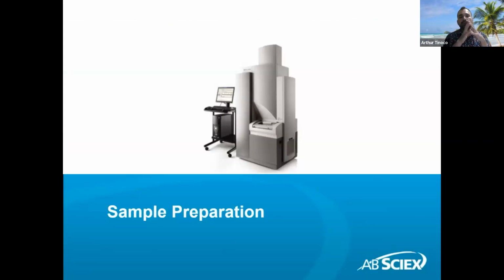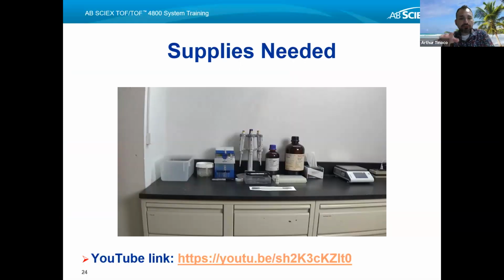So that gives you the context of the theoretical aspects of this particular technique and what's going on in terms of the insides of the instrumentation. So the next thing I want to talk to you about, which we will have practice with, is the process of sample preparation. All right, so here there is a video, but I'm not going to actually show the video because basically what it's showing you is the supplies that you're going to need when you're preparing samples.